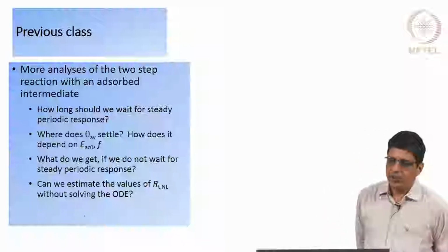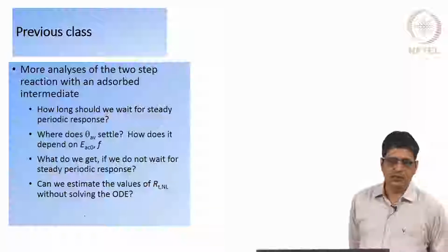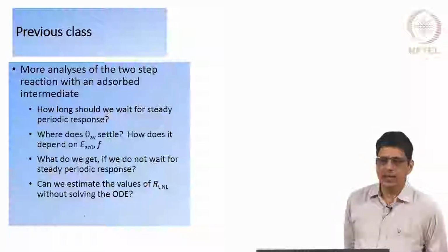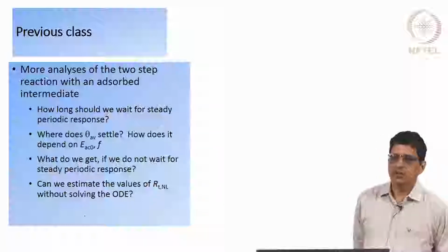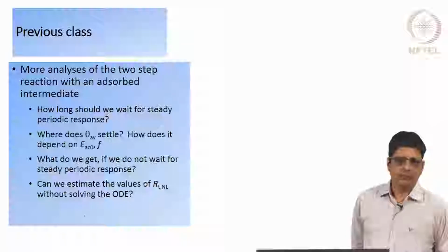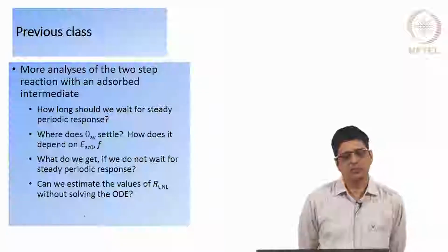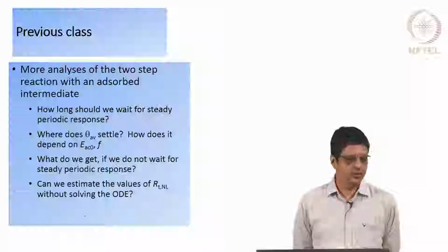We also saw that if we do not wait for sufficient time and acquire data, then the results are going to be different, especially at larger amplitudes. And we just mentioned that the results taken under those conditions will not be KKT compliant. We did not show that, but we just mentioned that. And we also saw that it is possible to estimate the charge transfer resistance under large amplitude perturbation using a heuristic method that is not proven to be valid under all conditions, but it seems to be working correctly for at least the mechanisms we have tried and the parameters we have tried.